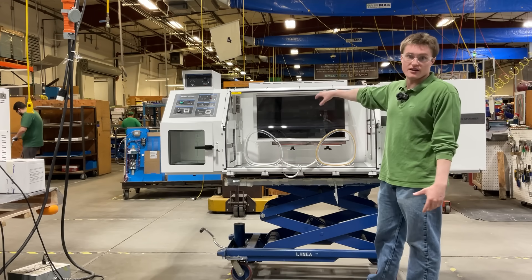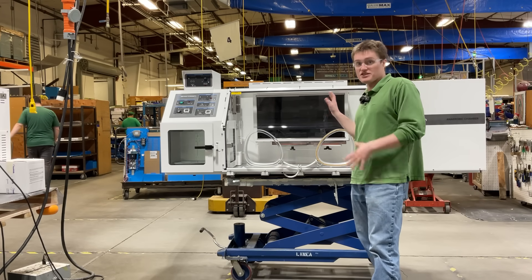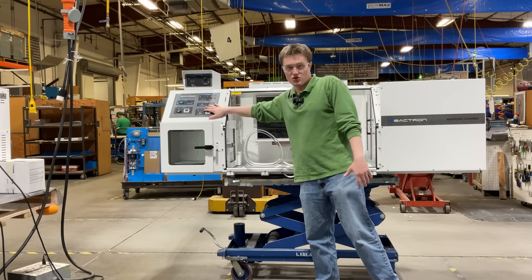We have the main chamber incubator. This is a 300 petri dish capacity incubator, the same one as our Bactron 300. It is controlled with this main control panel.